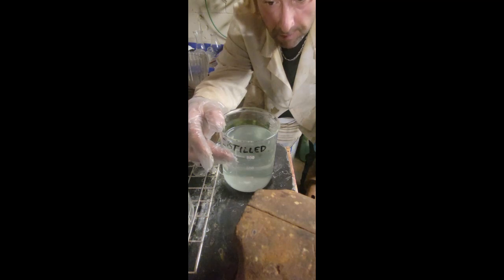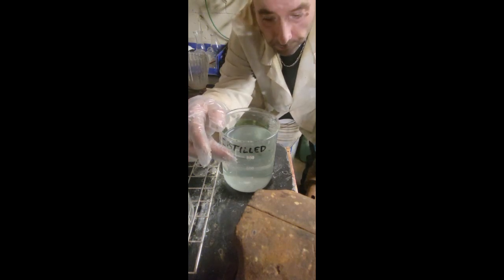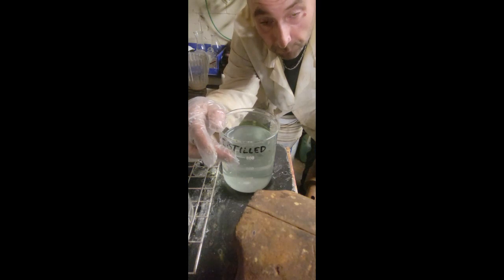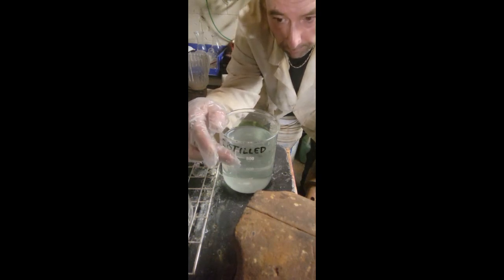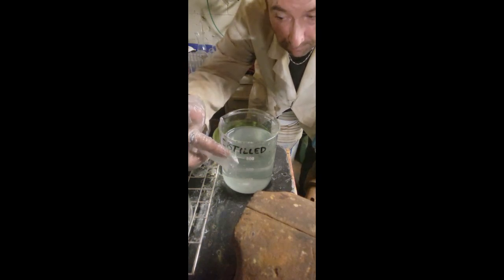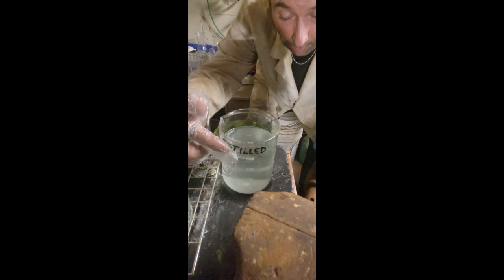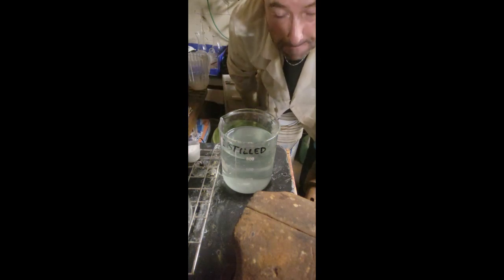Distilled or tap. I prefer distilled for most of my reactions. Tap water is okay. So don't stress if you can't get your hands on some distilled right away or they're sold out. You can make do with tap water, not an issue. But I just prefer to use distilled for most of my reactions. All right, so we're going to go with that. Fill your 1 liter beaker up to 800 milliliters of distilled water. Do not add salt or anything else to it, all right?